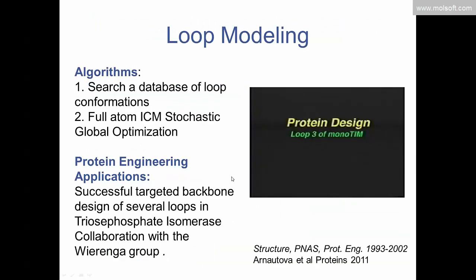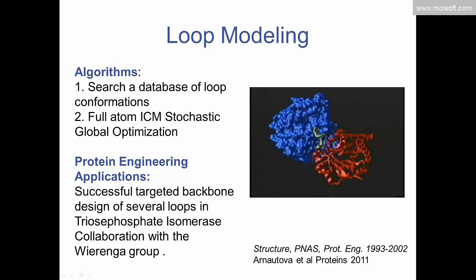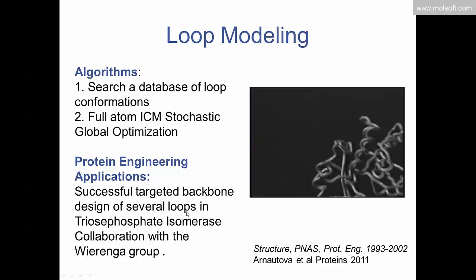So today we're concentrating on loop modeling. And there are different approaches which we'll talk about. And this is just an example of a success story with triose phosphate isomerase.